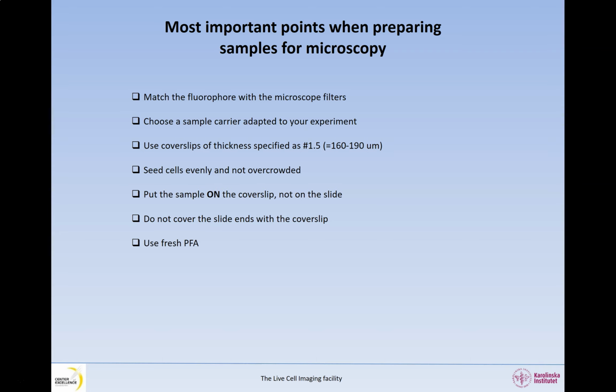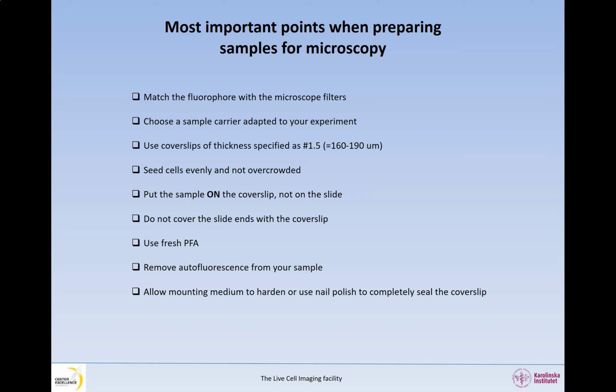Use fresh paraformaldehyde. Remove autofluorescence from your sample. Allow mounting medium to harden or use nail polish to completely seal the cover slip. Use the maximum volume of medium for live cell imaging.